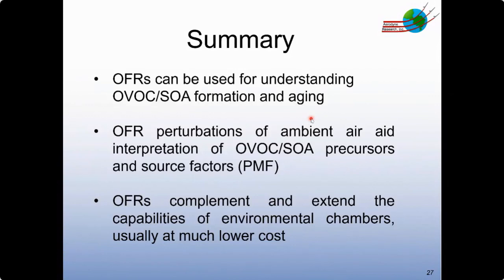And I would make the argument that there have been enough applications and enough demonstrations of OFRs to this point that it seems clear to me that they can complement and extend what can be done with traditional conventional environmental chambers, but usually at much lower cost.